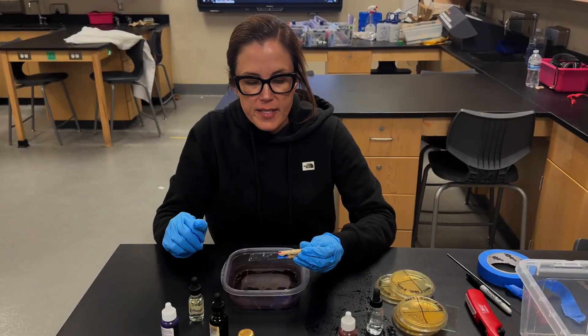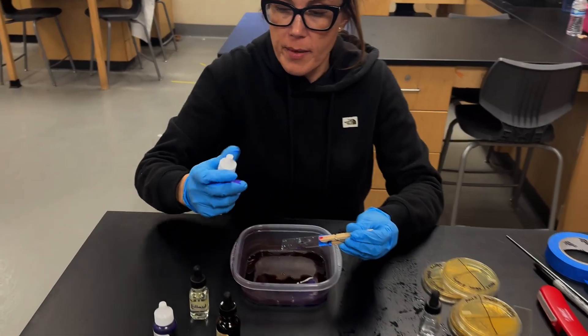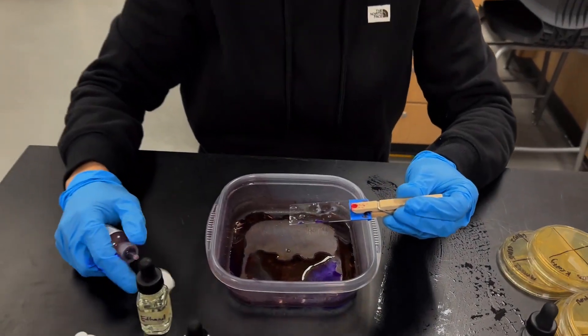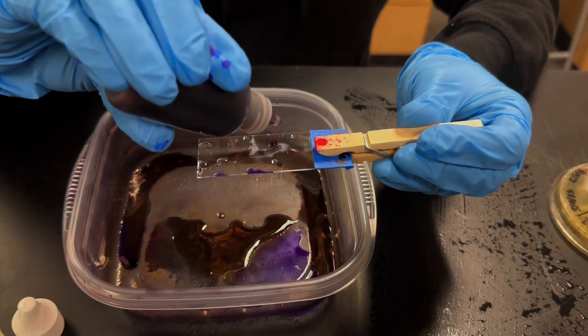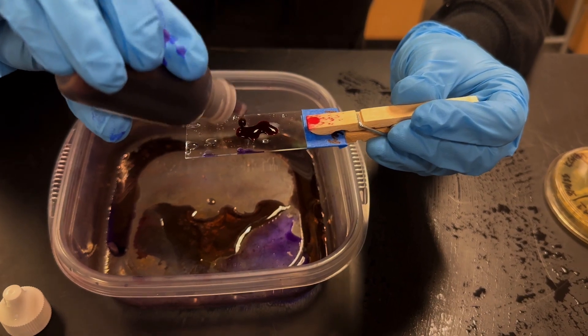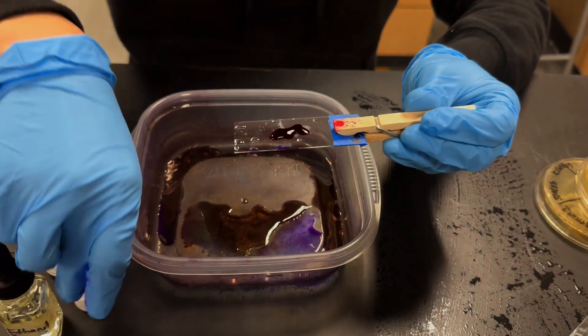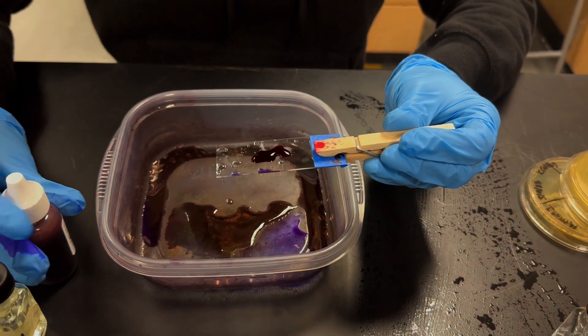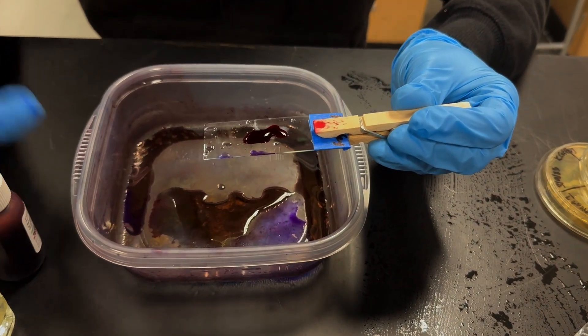The final step is to add safranin. So you'll open up your safranin container and again, you'll put one, two, three, maybe four drops on the slide. You'll set your timer for one minute.